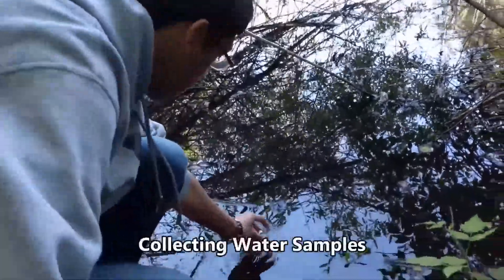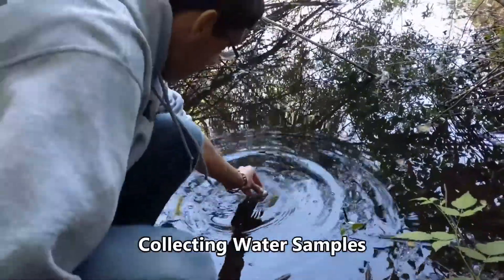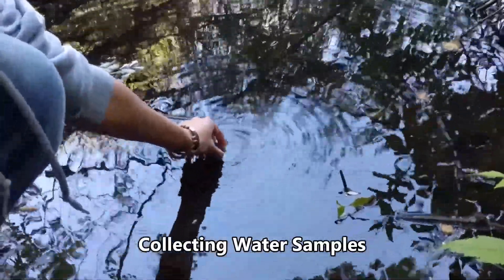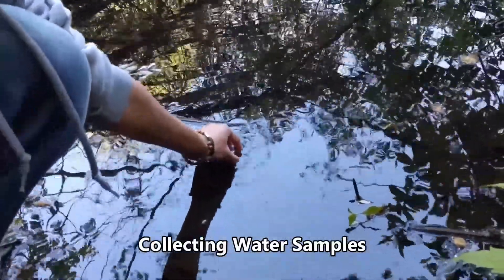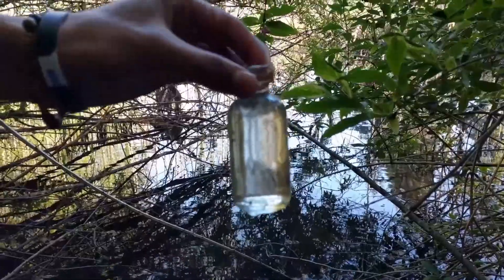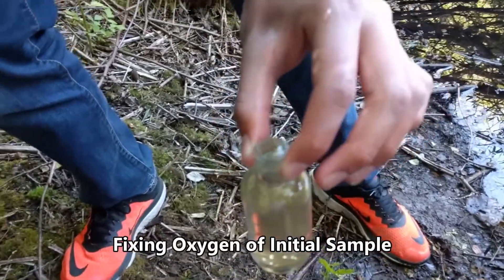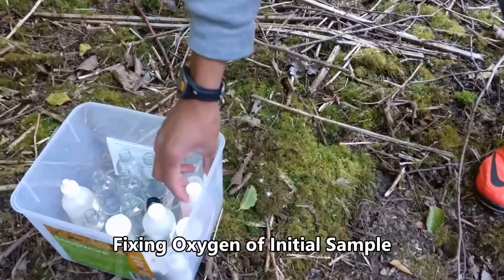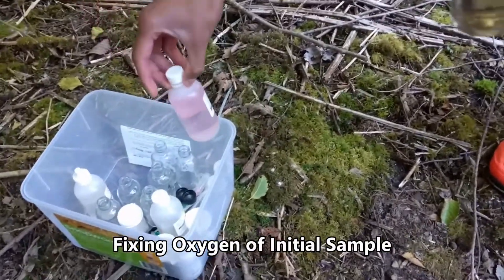So we're going to start by collecting our water samples, and we need to make sure that there are no air bubbles, as that will interfere with the oxygen levels. We're going to start by fixing the oxygen right away so that the oxygen level doesn't change.